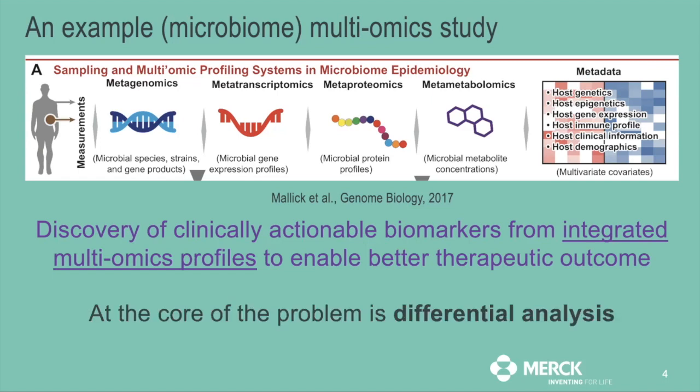At the core of the problem, I'm going to simplify by saying that differential analysis is a bulk of that, because we are interested in finding biomarkers, which is again a general term, based on the microbiome for the purpose of further investigation. So if we can identify a feature from anywhere in the microbiome multi-omics that is differentially abundant or expressed, I think that forms the basis of any follow-up investigation.